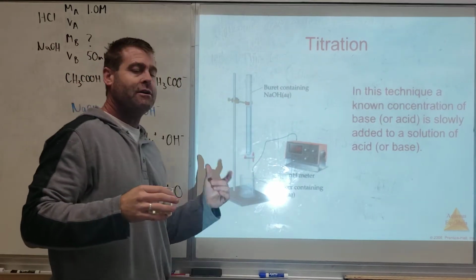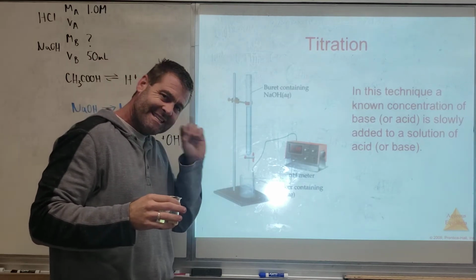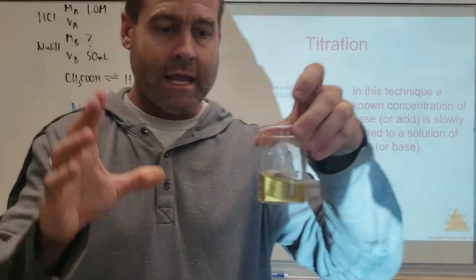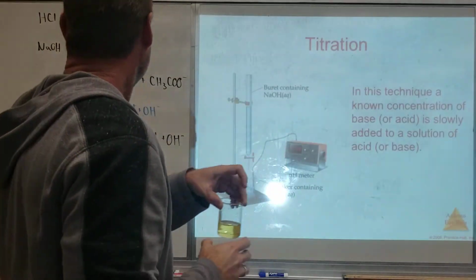Using a burette would allow you to add it very slowly so you can reach the exact point at which the H+ ions equal the OH- ions. So now, let's see what we've got.